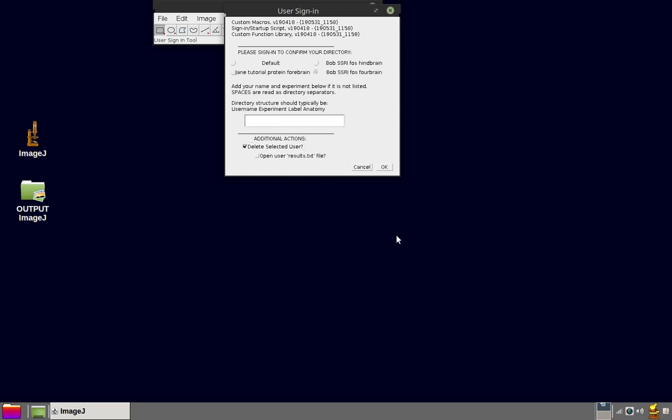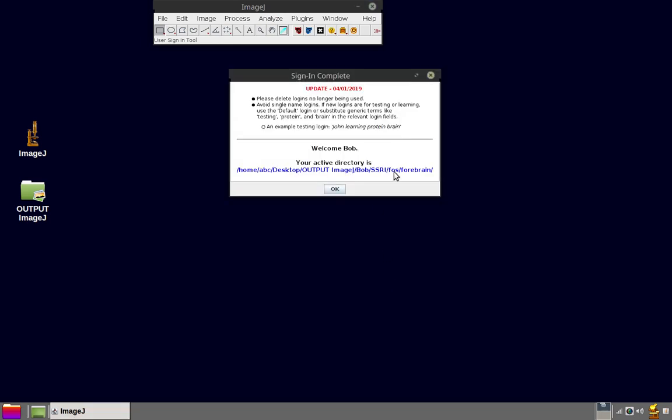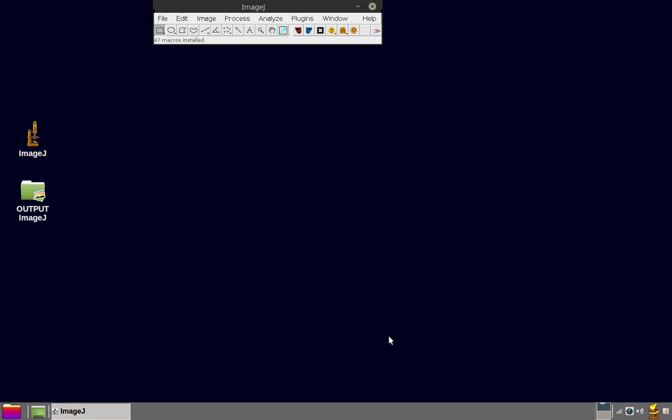And create another login with the correct name. That's better.